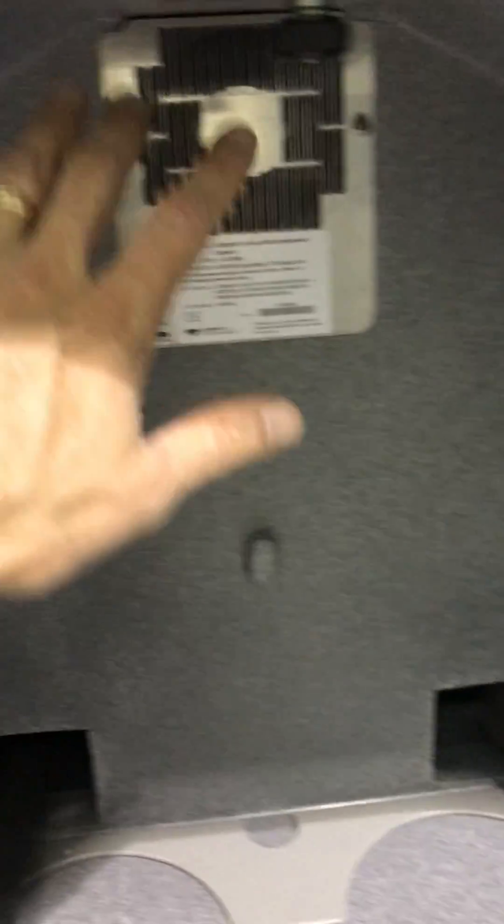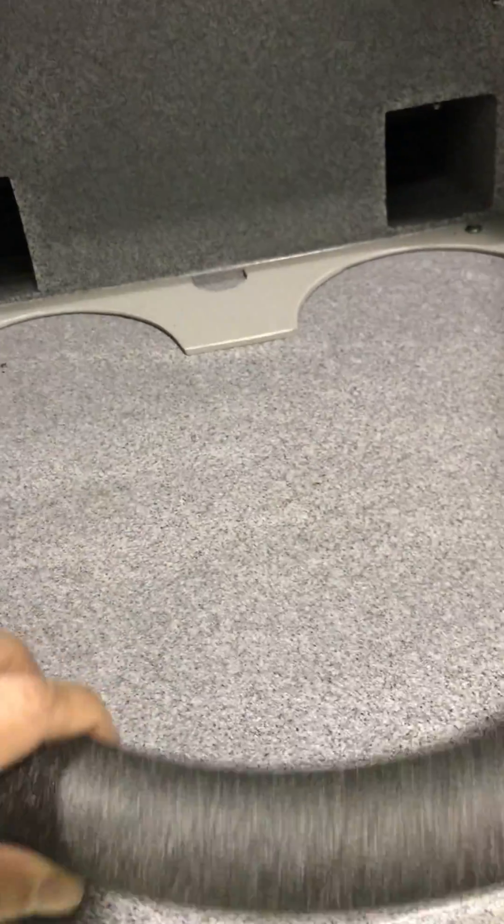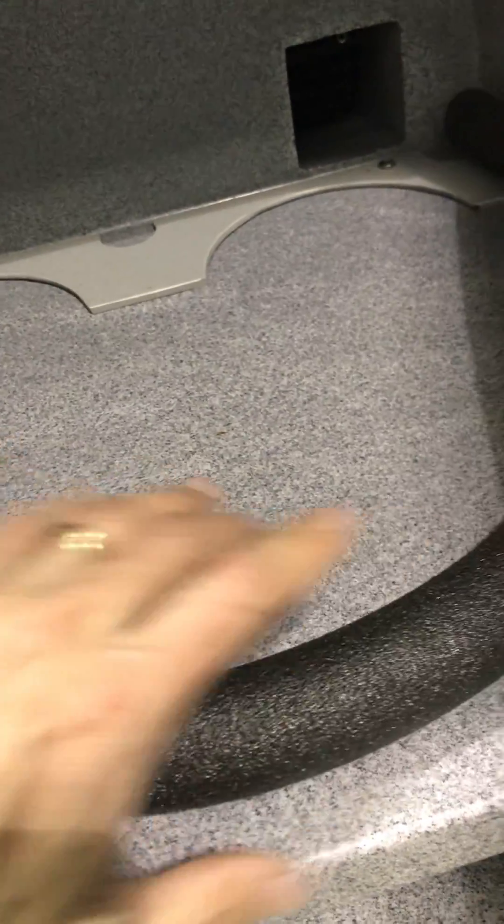Looking at the interior of the unit — it's getting pretty cold now, and it's only been on for a few minutes. I can feel the cold air coming in. As you can see, the center unit here — there's no tubes coming in here, and then maybe one at the bottom. There's the insulation coming in.